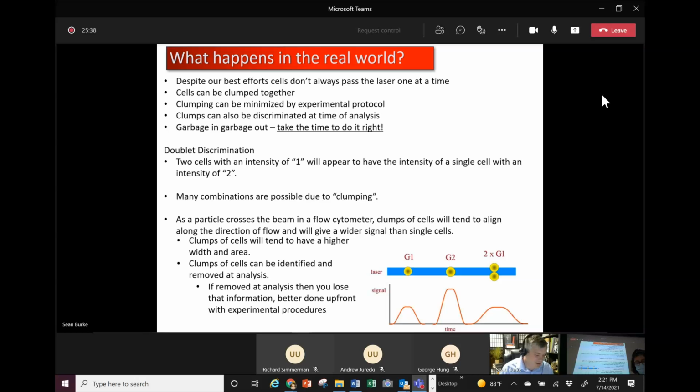They clump together. You're probably going to find this when you start working in cell culture, that you need to get cells to come off the bottom of the things that you're growing them on, or when you grow them in suspension, they all like to stick together. Well, in a cytometer, that still happens, right? And we need to find ways to pull these cells apart so that they go past our laser one at a time. And I think one of the most important things when I learned about cytometry in the beginning is really clumping and those cells sticking together, which you don't want when you run flow cytometry.